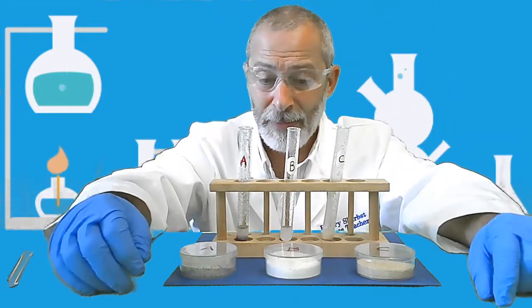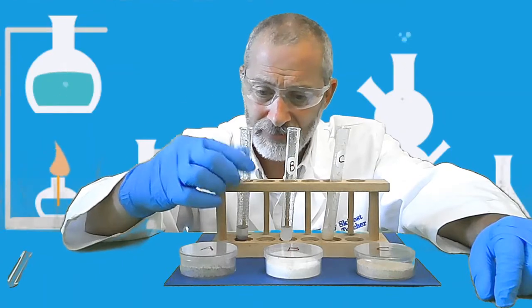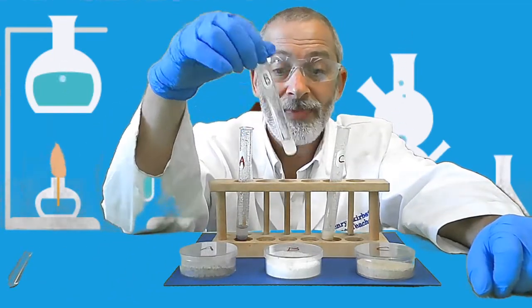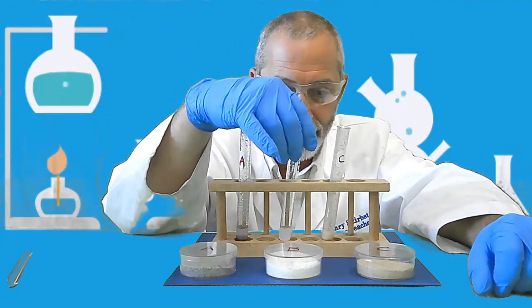So to recap, test tube A observations: settling of sediment, no bubbles, kind of boring. Test tube B: bubbles initially, but no more bubbles now, and just settling, no odor.